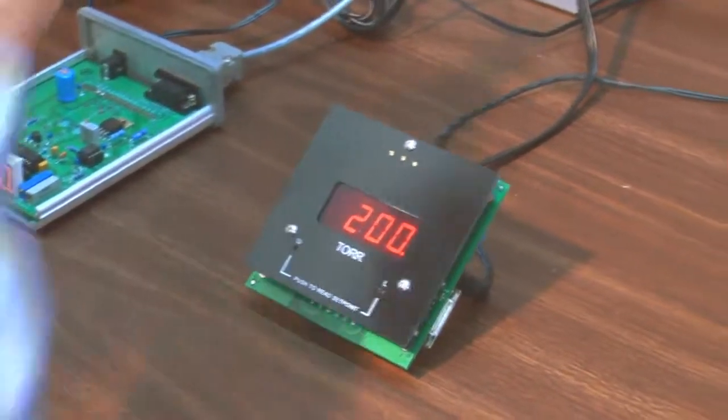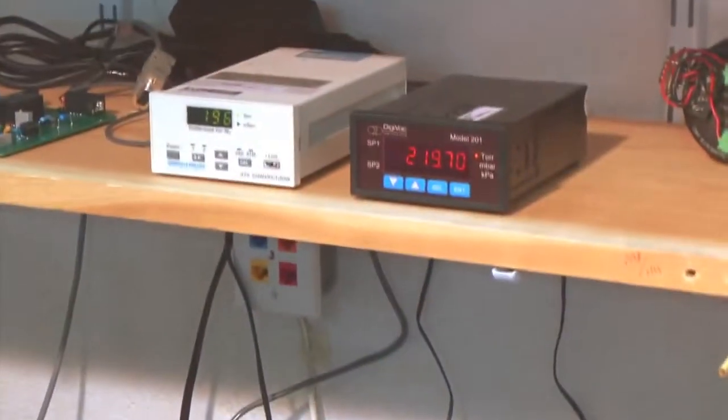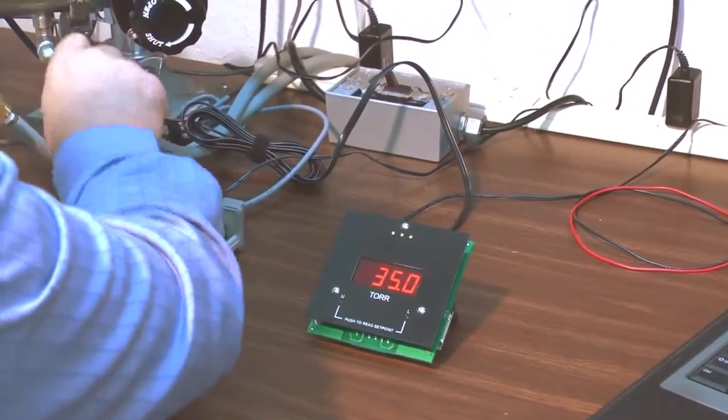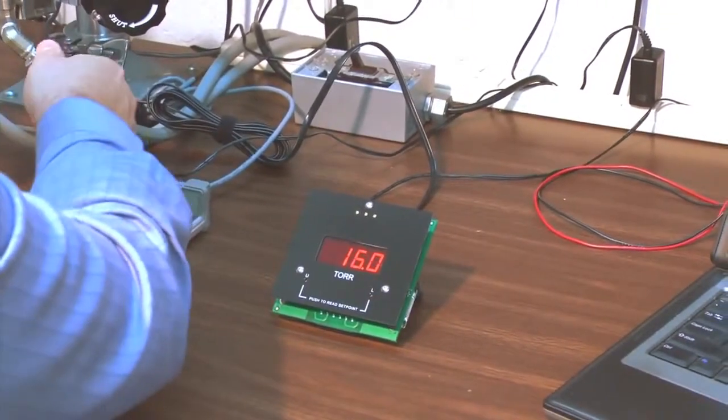219 torr on our barotron, 200 torr on our 801W. 19.5 torr on our barotron, 34 torr on the 801W. Looks like we'll make another correction down on the bottom end. To do that, we'll pump our system all the way back down to hard vacuum.